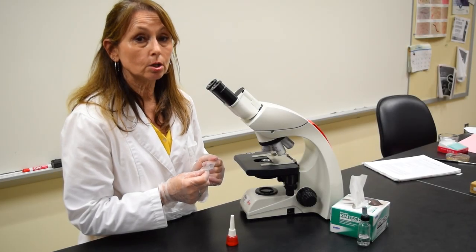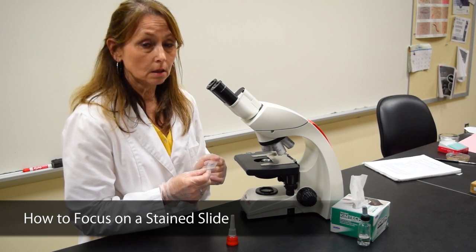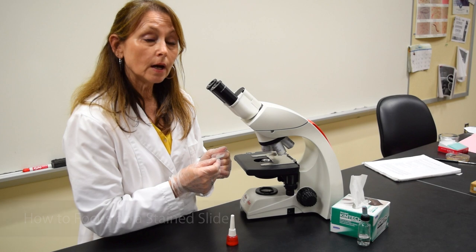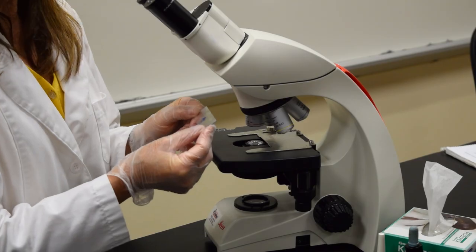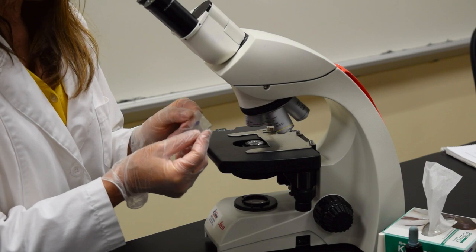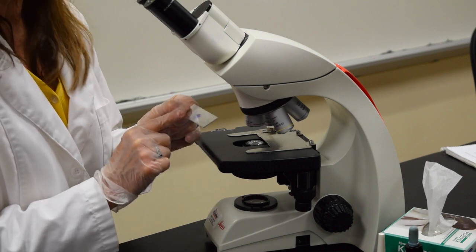This demonstration is to show you how to focus on a prepared slide that you have stained. Right now I'm going to show you how to focus on a simple stain. When you look at a stained slide you should be able to see some coloration. In this case I can see the purple dye on the slide.